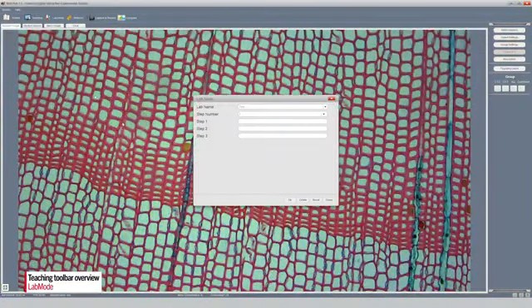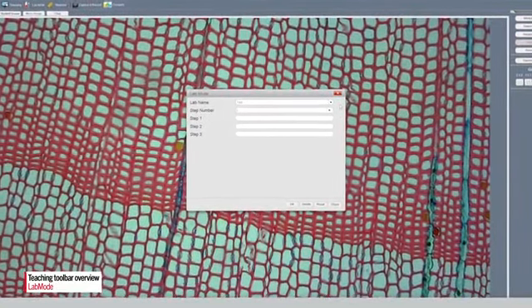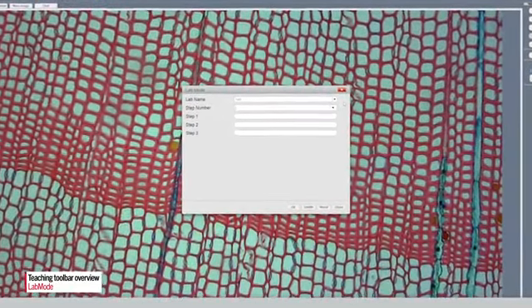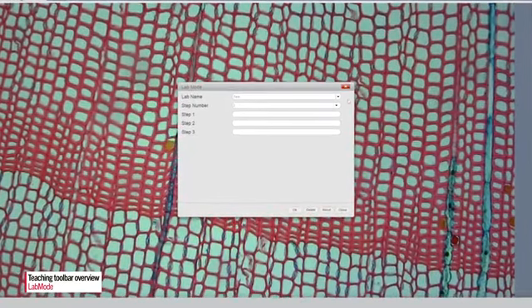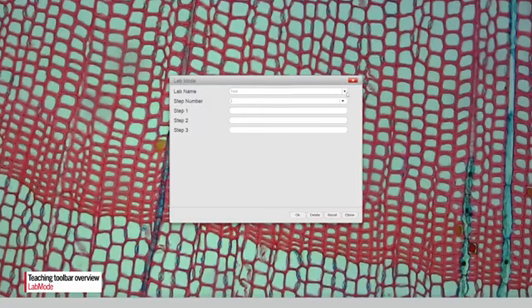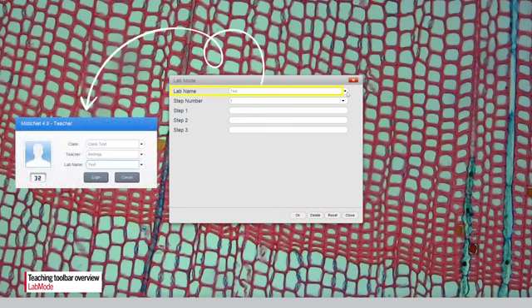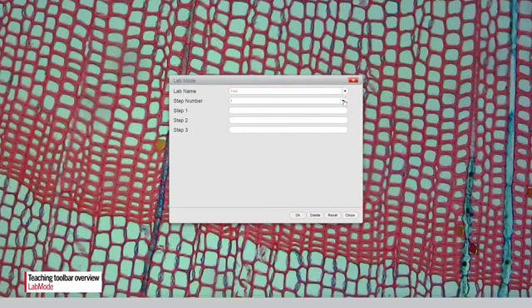Lab Mode is one of the most important functions of the MoticNet software. Here, the teacher can create a specific practice such as an exercise or an exam. You can also access practices created in previous sessions. To create a new practice, first assign a lab name. By default, this name is the same one selected at the beginning, but you can change it at any time.